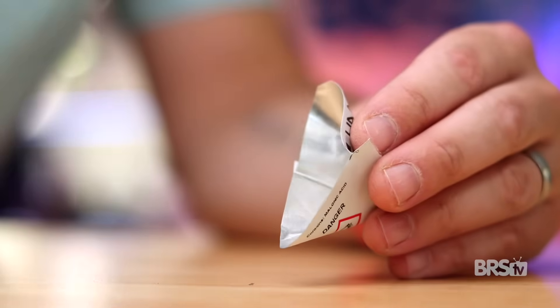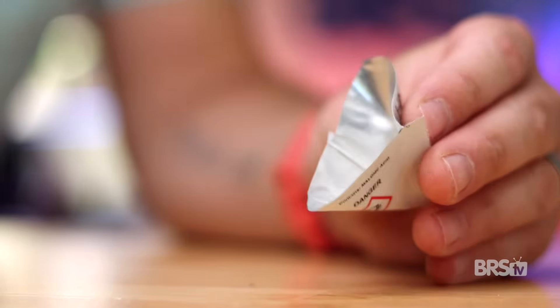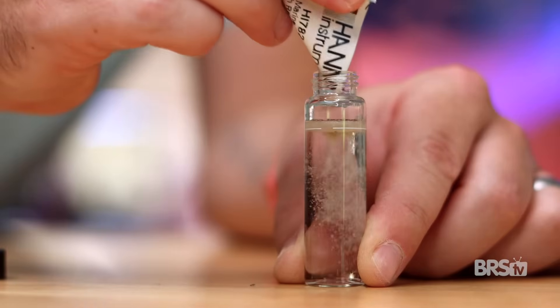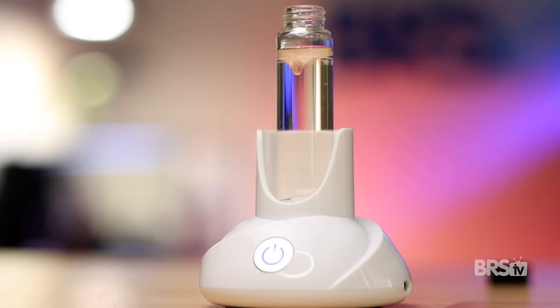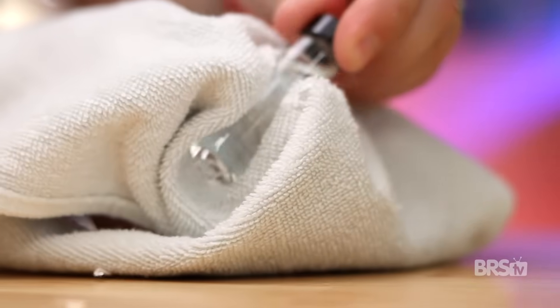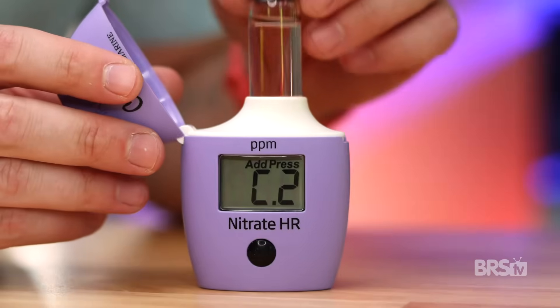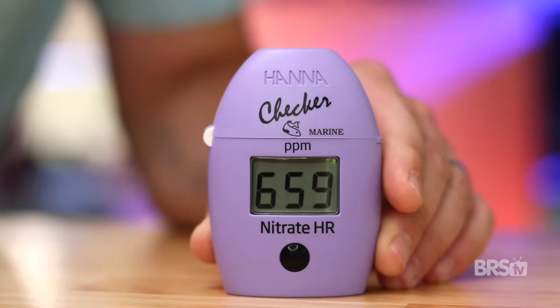It's a bit tricky, but I've found that pinching both sides of the reagent packet creates a little funnel, which makes it easier to get all of that reagent into the cuvette. Replace the cap and shake for two minutes. Or if you'd rather not shake the cuvette for two minutes, pick up the AutoAqua Smartster and it will do the work for you. After two minutes, wipe any fingerprints off the cuvette, slide it back into the checker, and press and hold the button until the seven-minute timer appears.